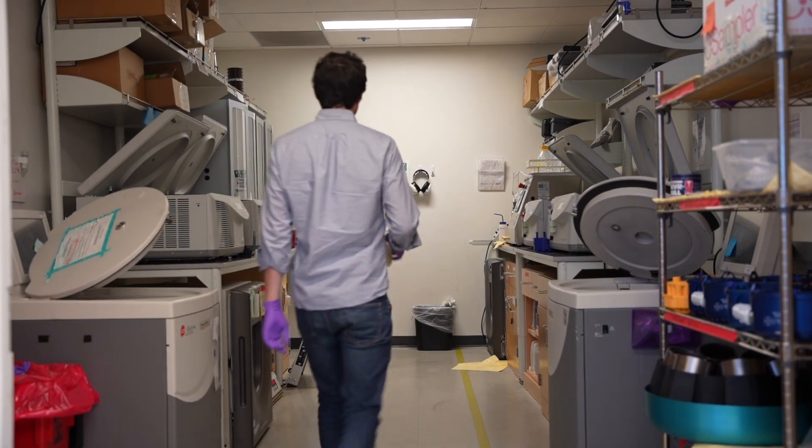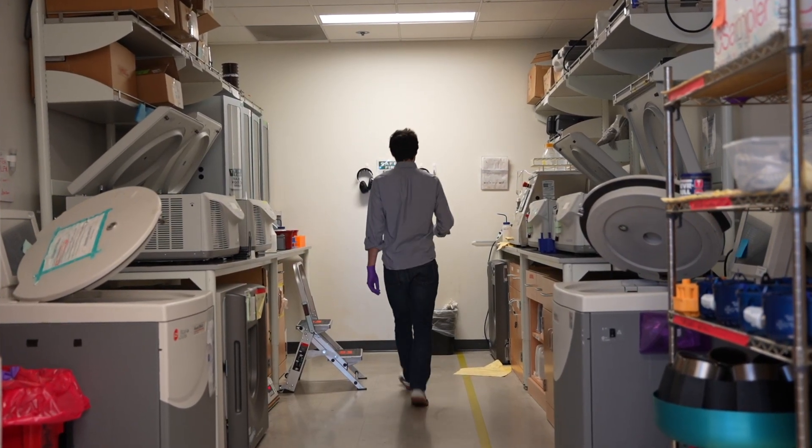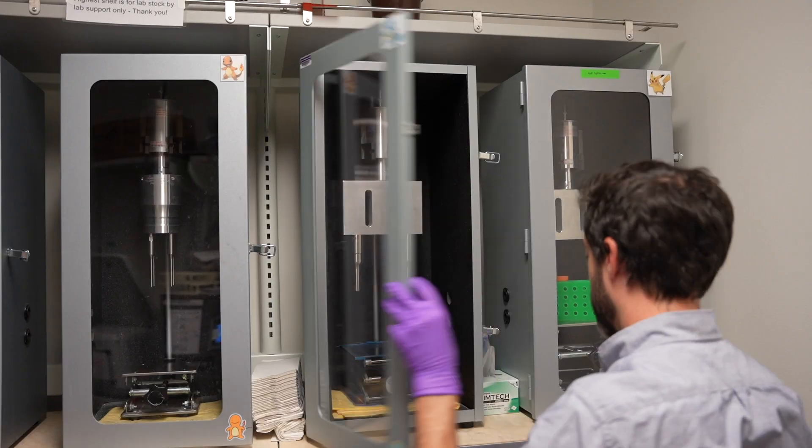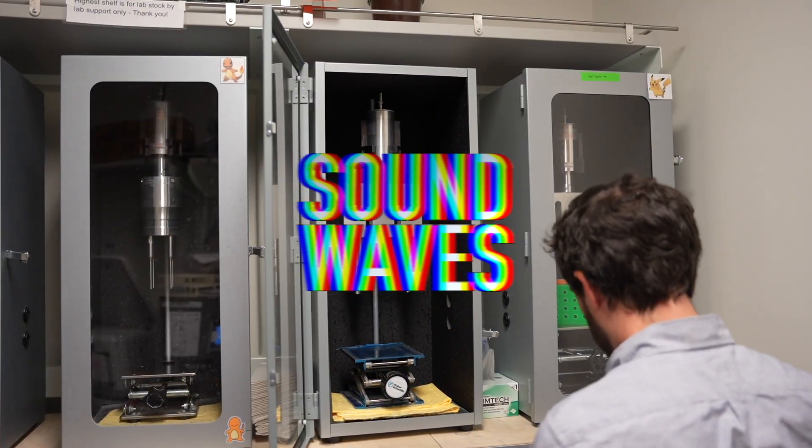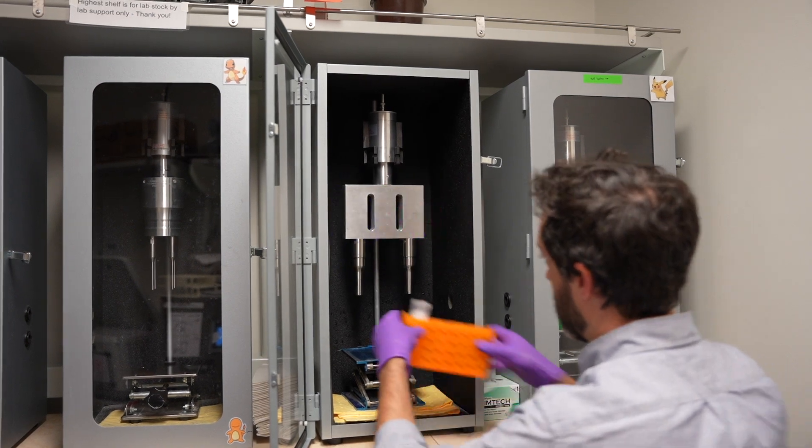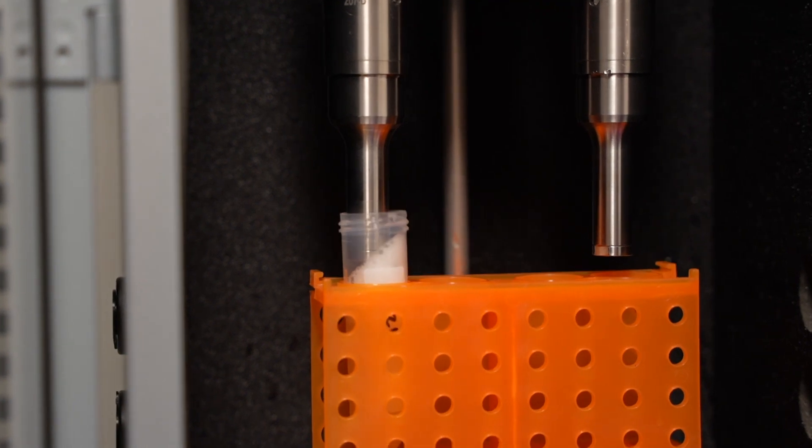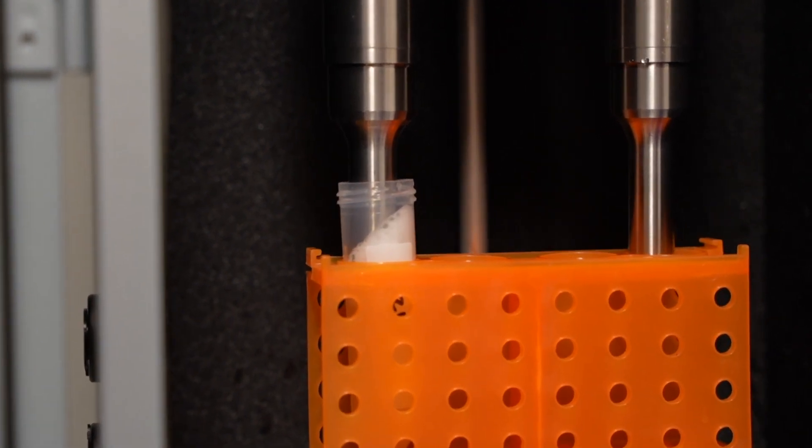The first thing we do is break open the cells to free our protein that's trapped inside. To do this, we don't use a hammer to hit the cells, we use sound waves. This machine is a sonicator. It has a metal rod that vibrates with super high intensity, emitting high-energy sound waves that rip open nearby cells.